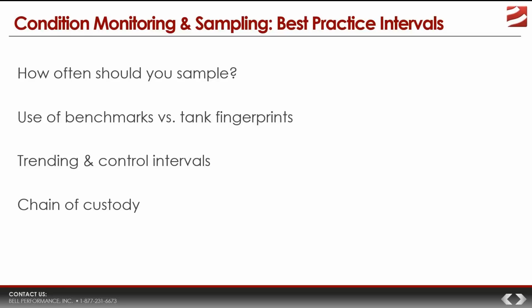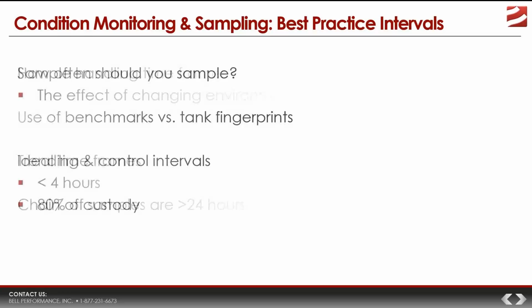So if we accept that all of this is true, acknowledging the importance of the chain of custody form really starts to imply to us or confirm to us the importance of sample handling. So let's talk about that a little bit.